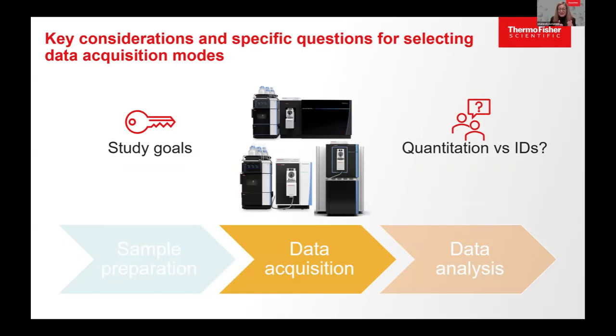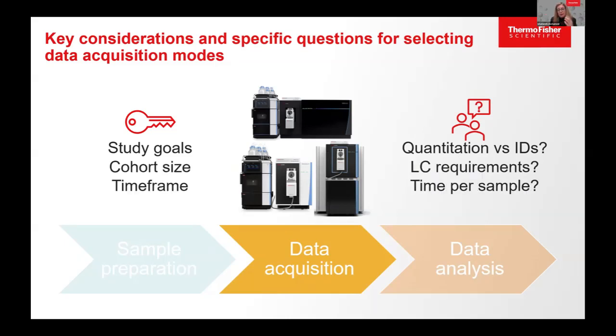I said you can cut it in half and increase your power of identification for discovery, since you're doing the further evaluation or verification at the quant level. And one thing that is really important when you pick the method for DIA or even DDA is actually the sample throughput. Because you have a certain number of mass specs in your lab and you know your lab capacity, right?